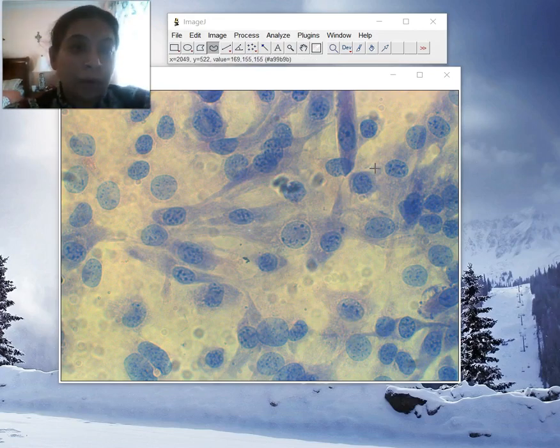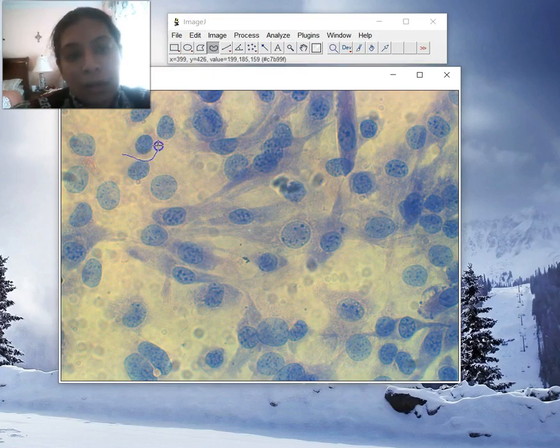This image is from a mouse myoblast cell culture that was in differentiation medium for a few hours or for a day, so they are starting to differentiate into myotubes. They are far from being fully developed myotubes at this time, but you can see that some cells still look very similar to how they look when fully undifferentiated, which is circular or boxy.